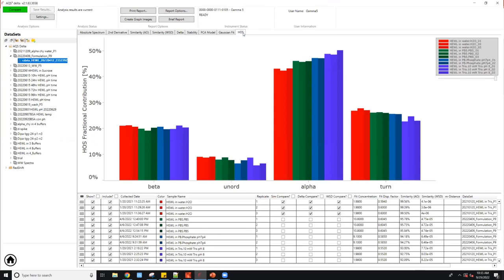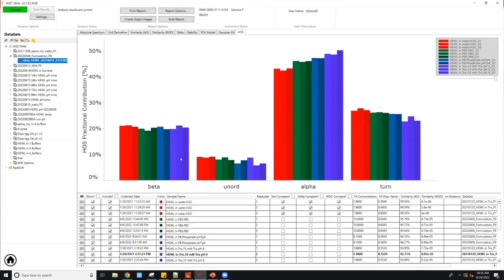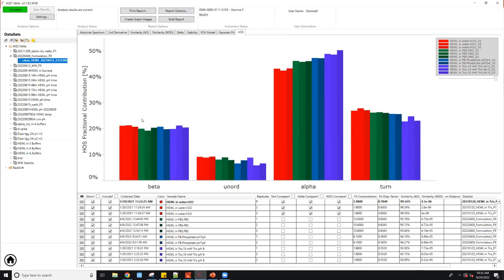Let's keep going to this HOS plot. HOS stands for higher order structure. This is a bar chart of the percent contribution of each motif to the overall structure. This is customizable as well. Here we're not showing the beta minus because we're not studying aggregation. But if you're doing aggregation type of study, you can show the beta minus chart as well. Here you can see the increase in alpha from water to Tris and decrease in unordered, meaning it's more ordered in Tris buffer.